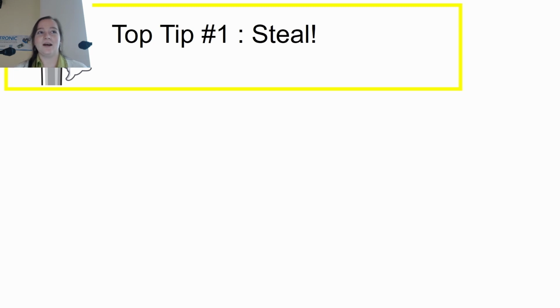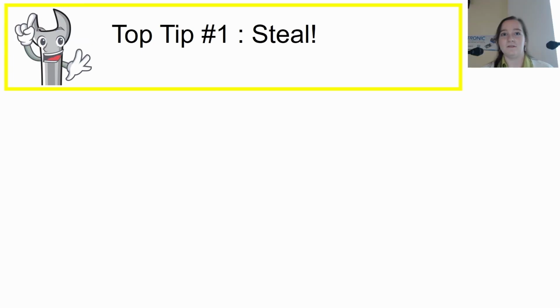So I had the scanning mechanism of the microscope. That's the 3D printer, that's sorted. Now I needed to build a microscope that would go onto my 3D printer. And this is where my first tip comes in, and that is to steal ideas from other objects or open source projects that are around you. And it's not really stealing, it's more taking inspiration.